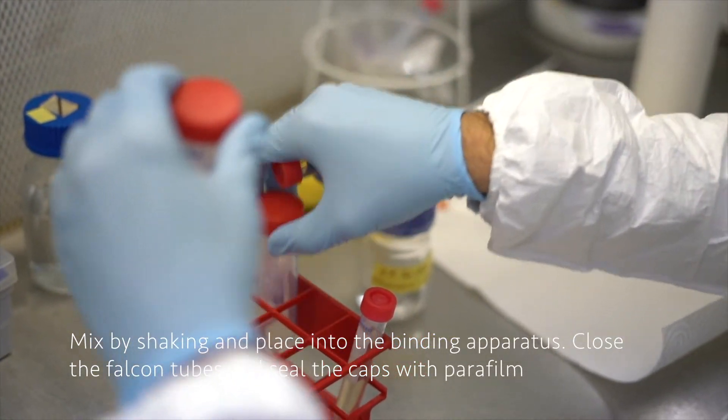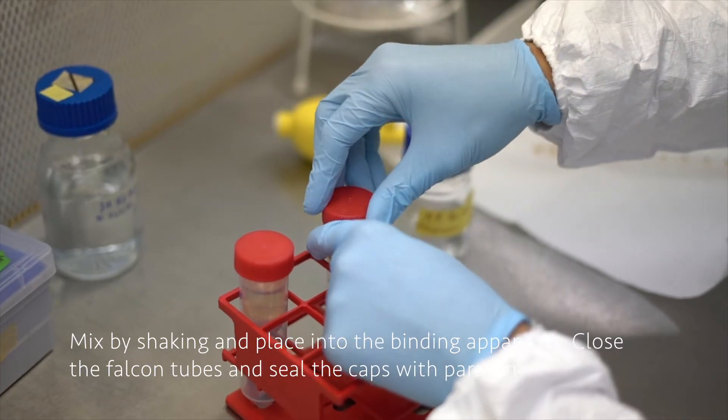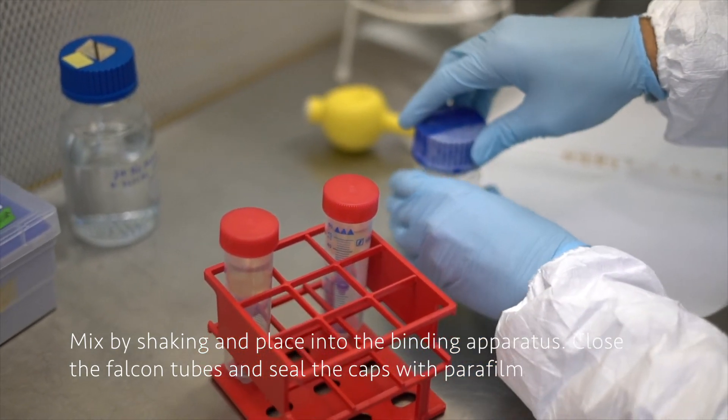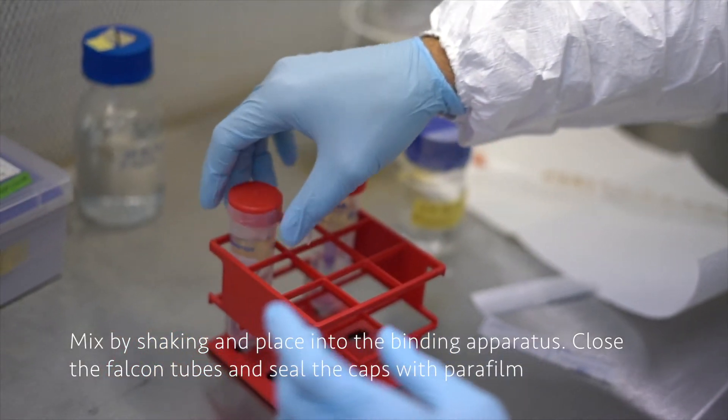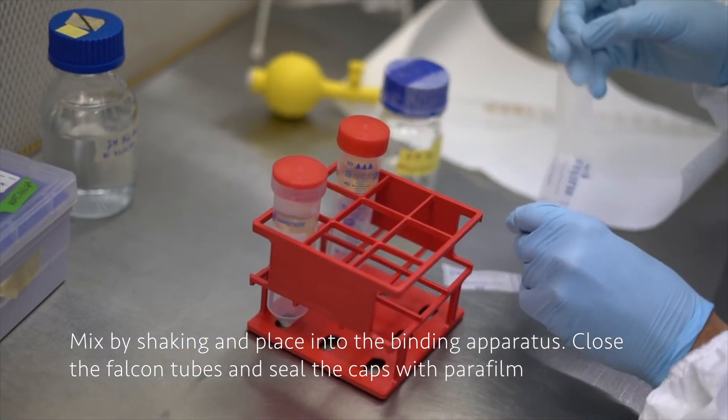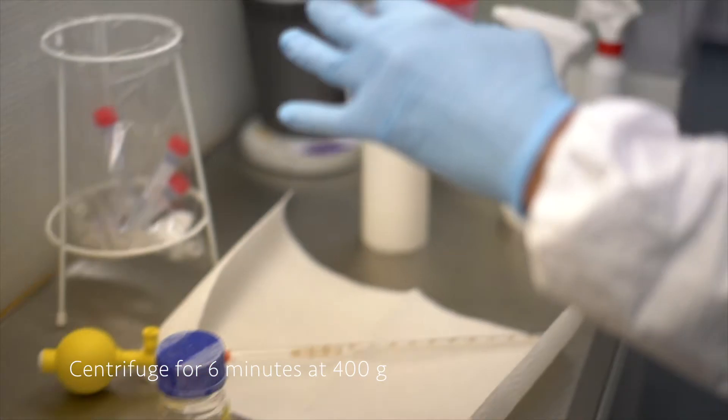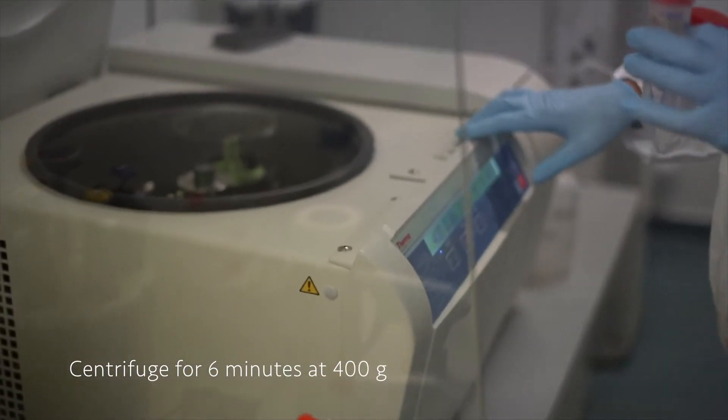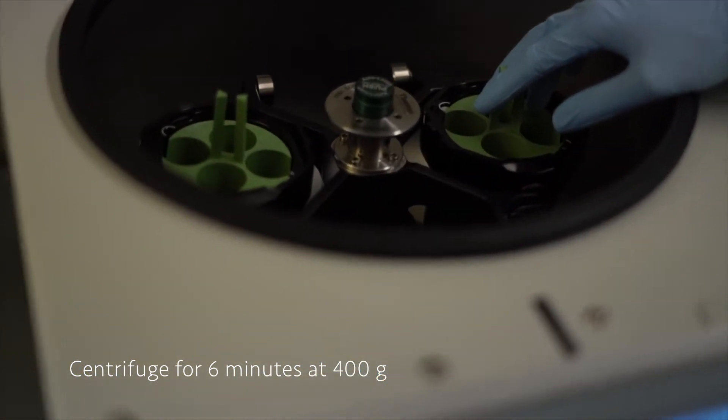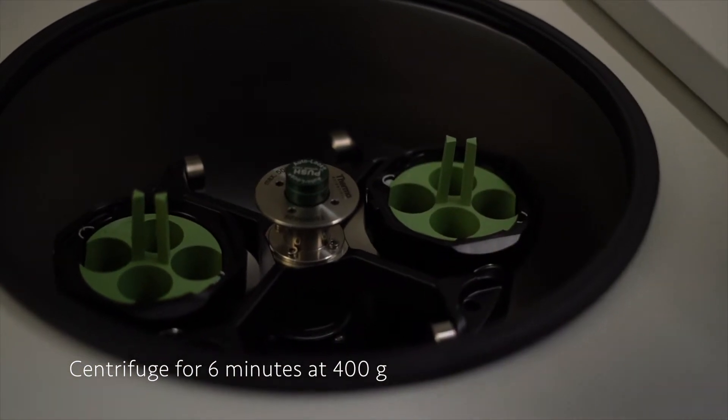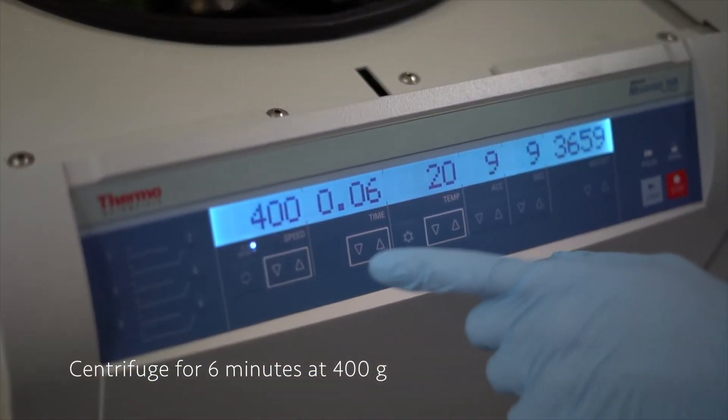Now we can mix everything by shaking a couple of times, and then place everything to the binding apparatus. Now we can seal the falcon tube with some parafilm, just because the Zymo reservoir is not going to close very well. And then we are going to centrifuge it in a bigger centrifuge. We need a specific rotor for a 50 milliliter falcon tube, and we are going to centrifuge them for 6 minutes at 400 g.